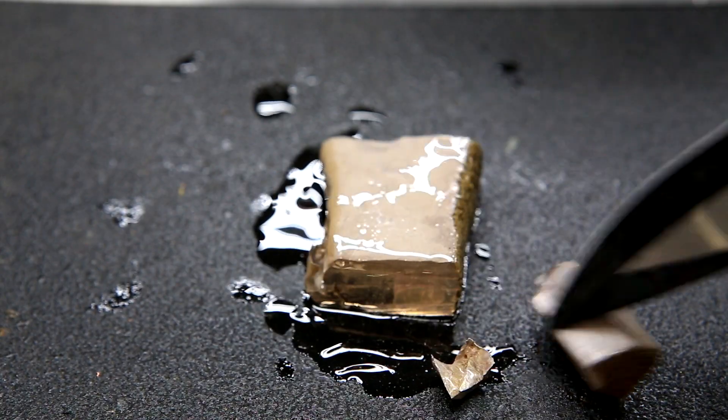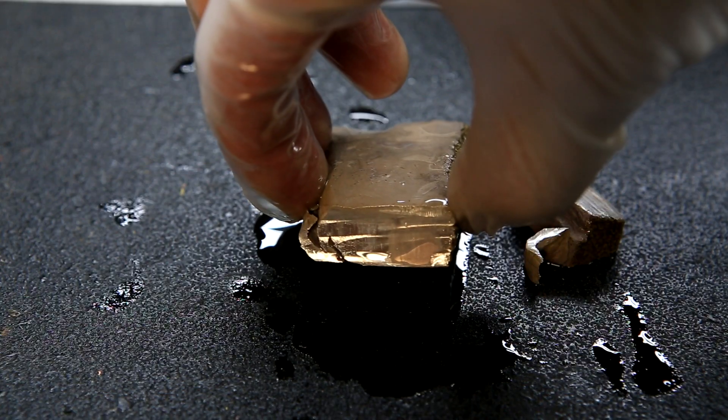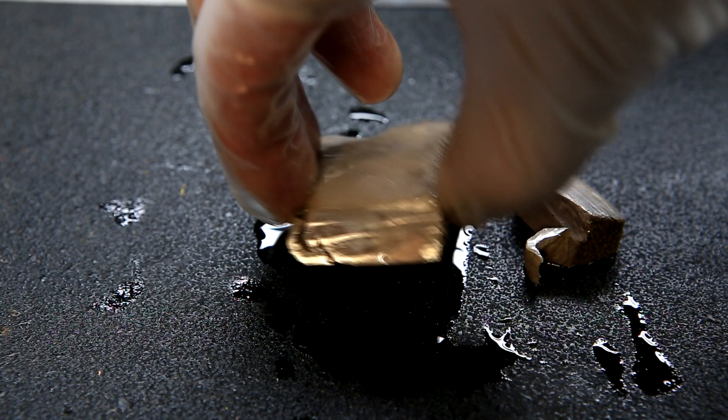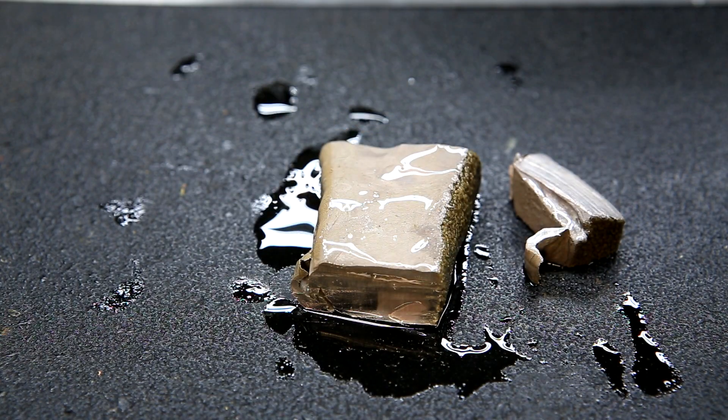The liquid around the metal is mineral oil that the sodium was stored in. You can see that once cut, the inside is a shiny silver. However, if left open to the air, it will quickly react and become dull again.